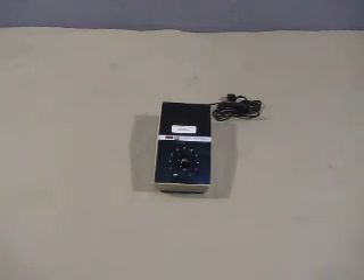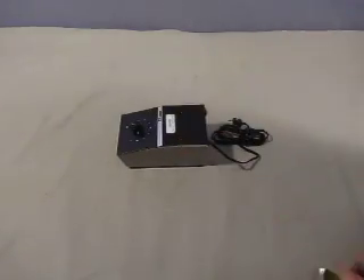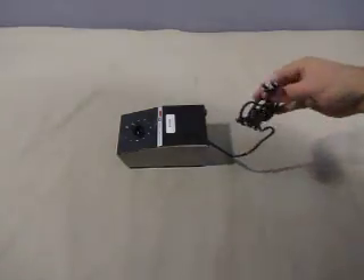Up for auction we have one Vickers Instruments Microscope Light Transformer. There's no light included, just a transformer. It's four inches wide, seven inches long, and stands about three inches tall. Standard plug.